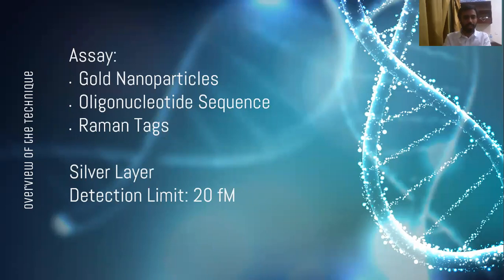Okay, so first of all, let me provide you an overview of the technique that the paper describes for detection of DNA and RNA. The paper describes a technique which involves the use of a three-component sandwich assay, which involves gold nanoparticles, oligonucleotide sequences, and Raman tags. And then you get a silver layer that is formed around this assay, and which is used for the SERS signal enhancement.